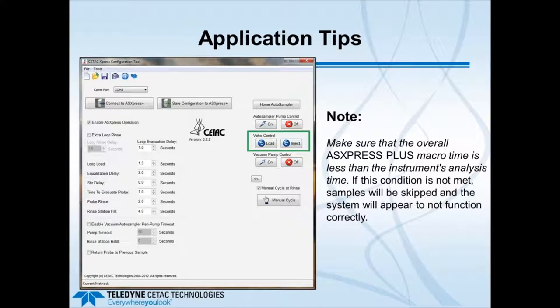An important software note: the macro time—meaning the total time set in the software for parameters like loop load and equilibration delay—must be less than the instrument's total analysis time. If that condition is not met, samples will be skipped and the system will appear not to function correctly. You can verify this by running a manual cycle to confirm the ASX Express timings are less than the overall ICP method timing.